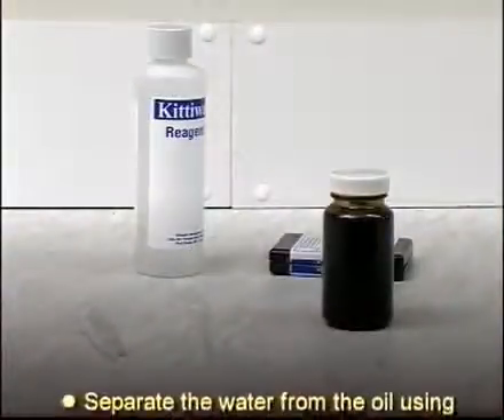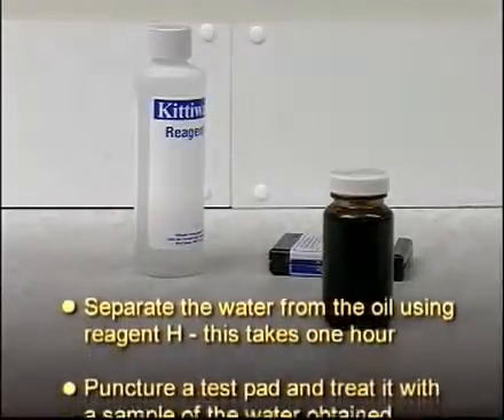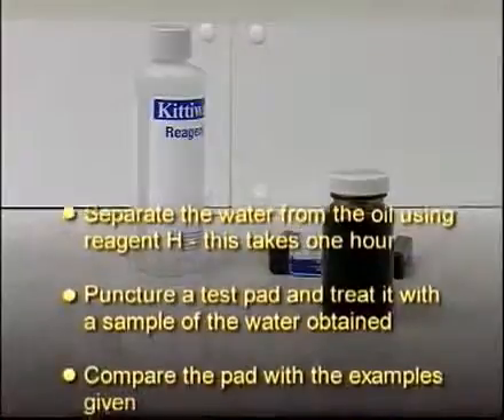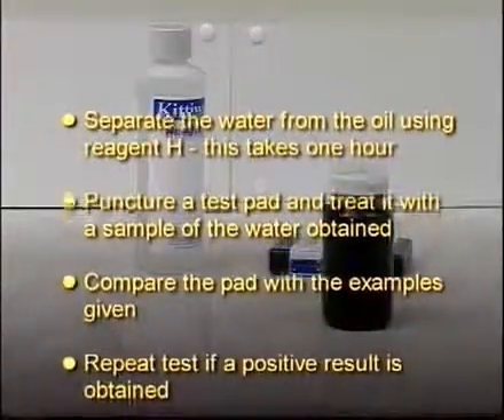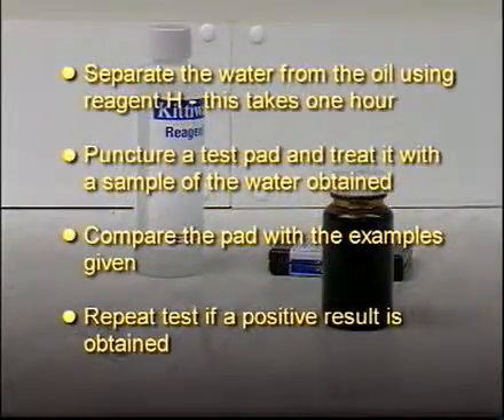To summarize: separate the water from the oil using reagent H — this takes one hour. Puncture a test pad and treat it with a sample of the water obtained, then compare the pad with the examples given. Repeat the test if a positive result is obtained. Beware of contamination by sweat.